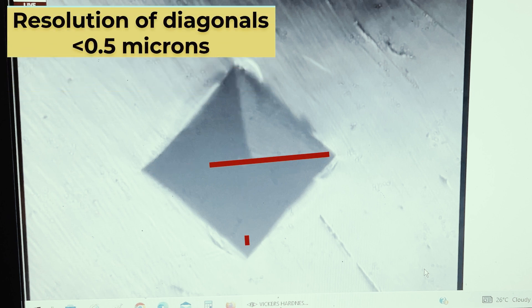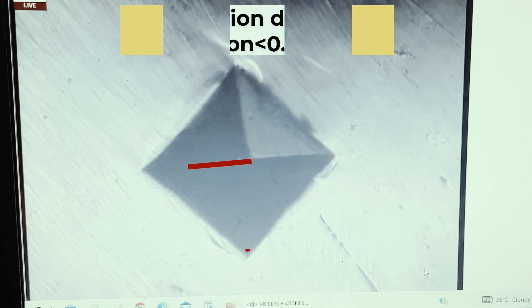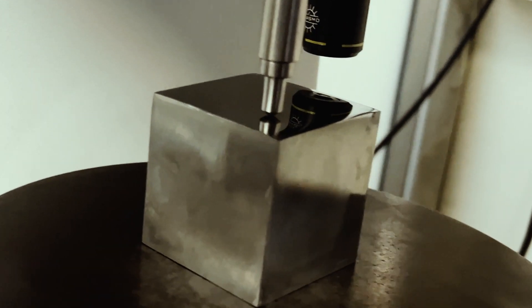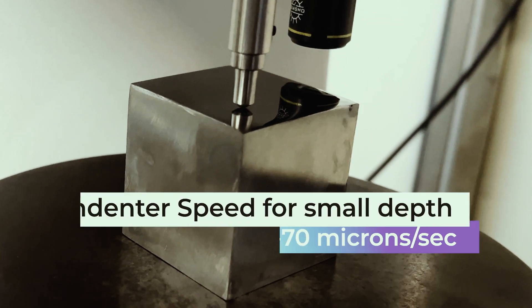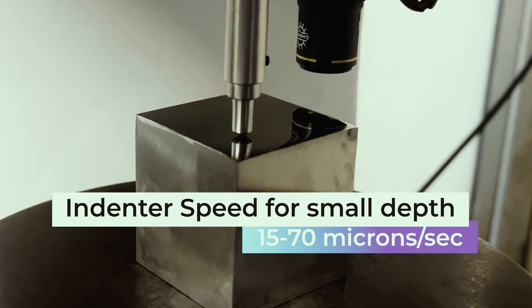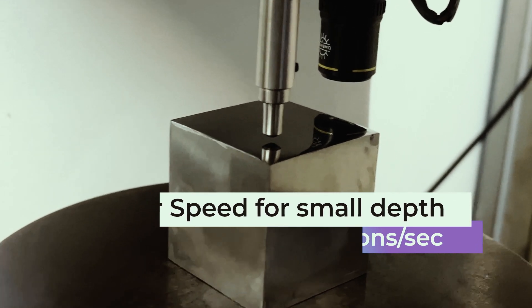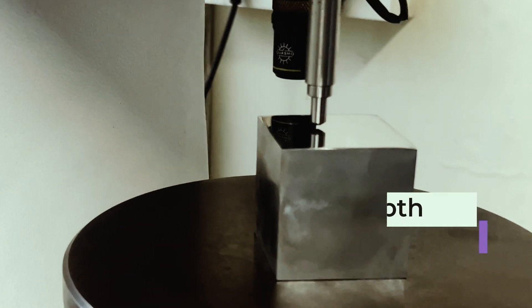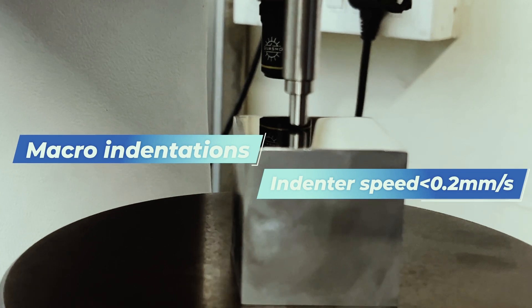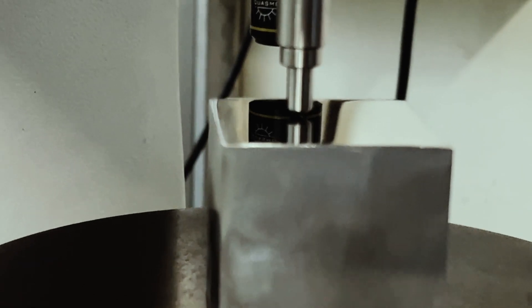For indentations less than 20 microns, the length of the diagonals should be determined to within 0.1 micron or less. For micro indentations having an indentation depth in the range of a few microns, the velocity should be between 15 microns per second to 70 microns per second. For macro hardness testing, the contact velocity should be within 0.2 mm per second.